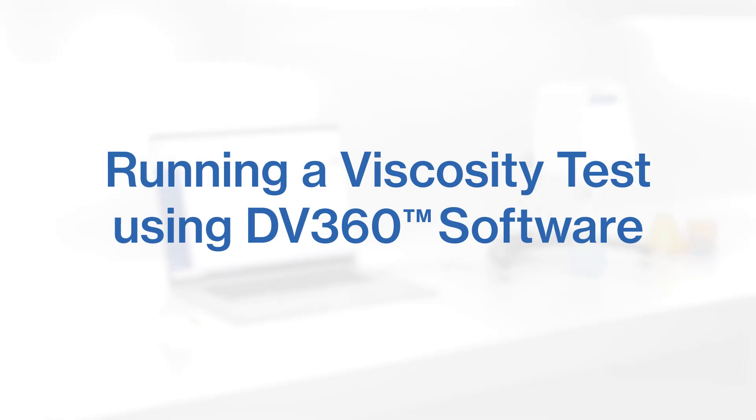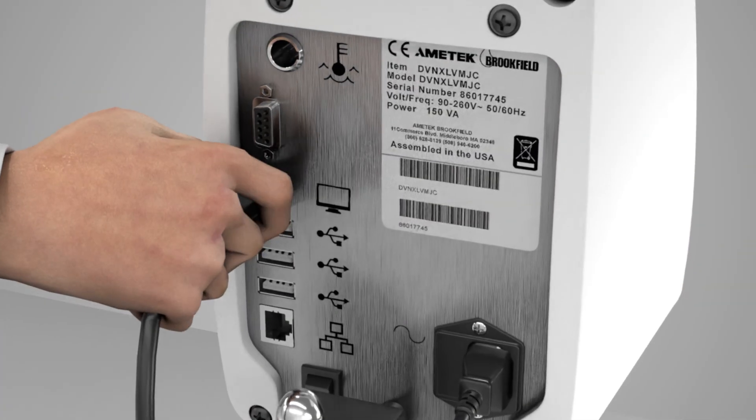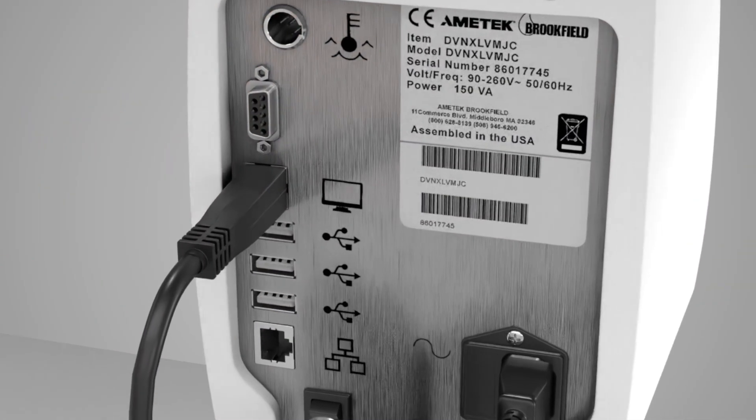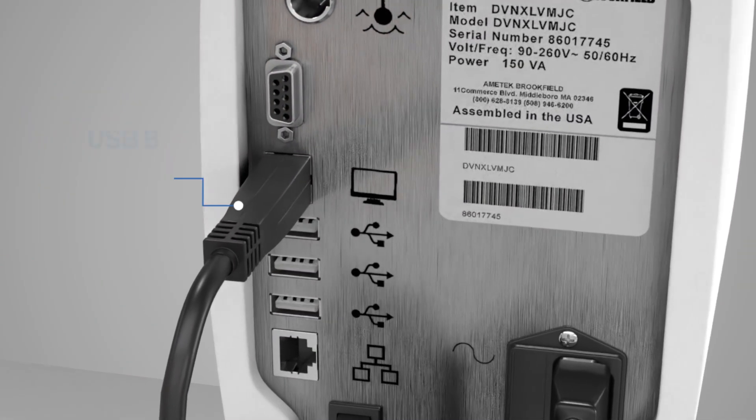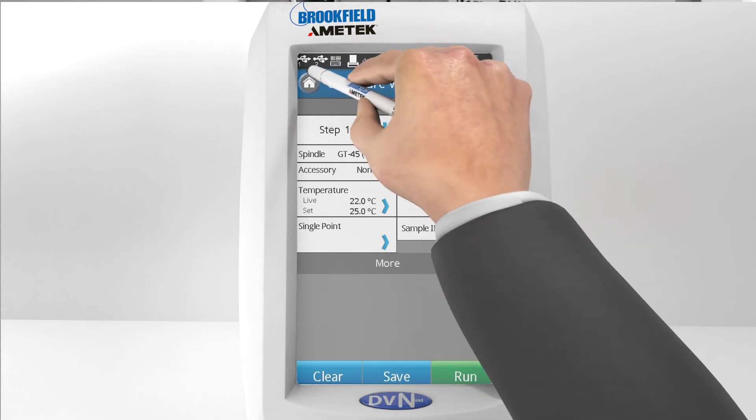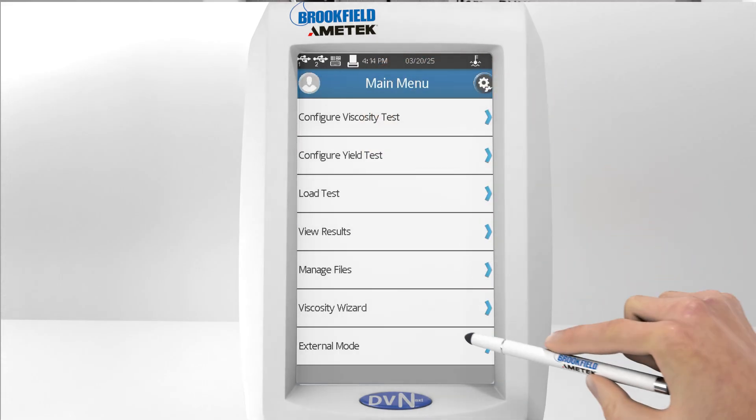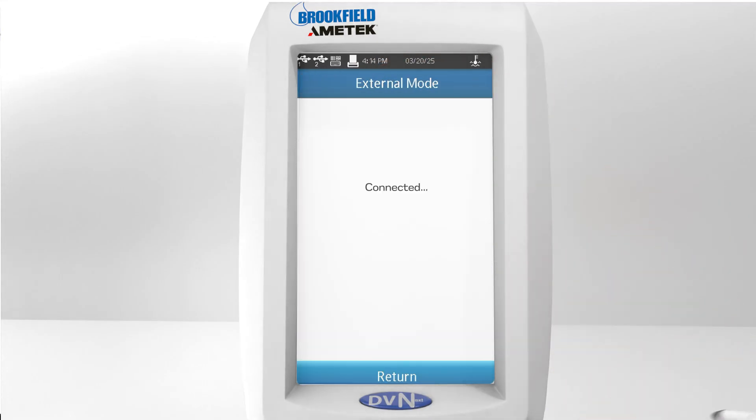Let's learn how to run a simple viscosity test. The first thing we need to do is connect the device to the software. Connect your instrument to the laptop with a USB A to B cable. On the instrument screen, go to the main menu and select External Mode.